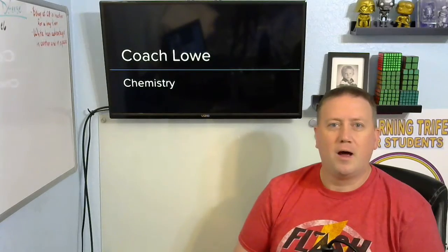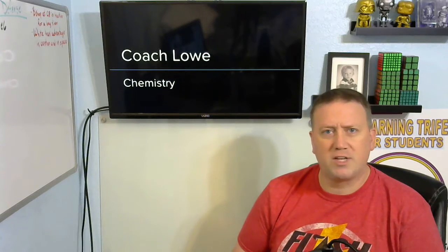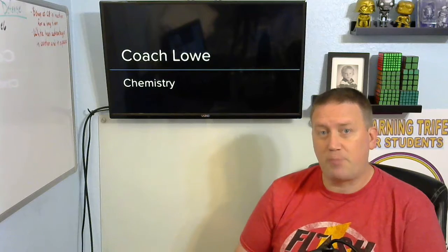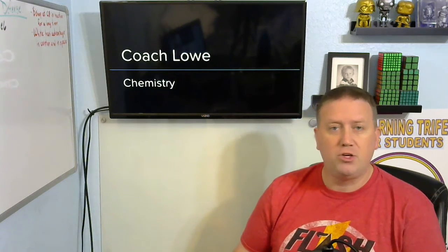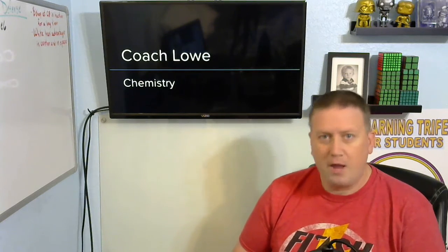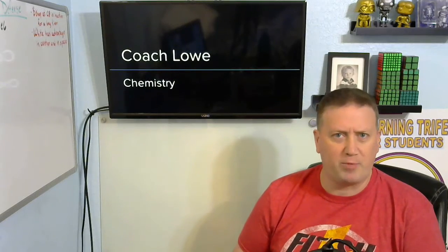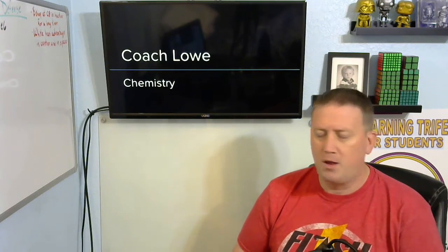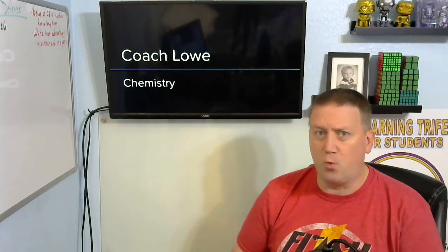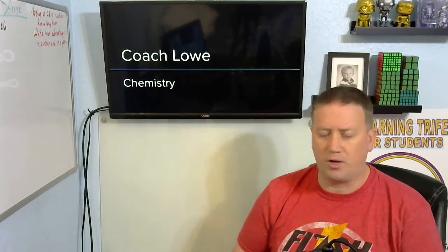Hey everybody. A big part of today's activity is what we call chromatography, and that's a process of taking a mixture and separating the parts of that mixture using a solution and chromatography paper. Or in the classroom, I usually use filter paper as my chromatography paper. It does the same thing. So I'm going to explain what chromatography is real quick so that you understand what's really going on.